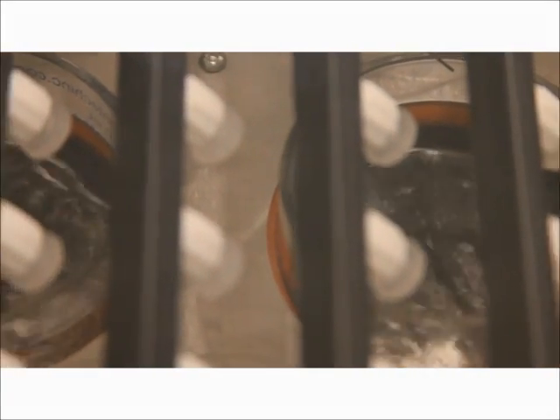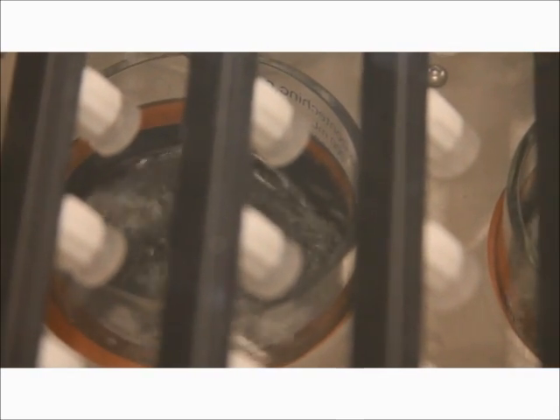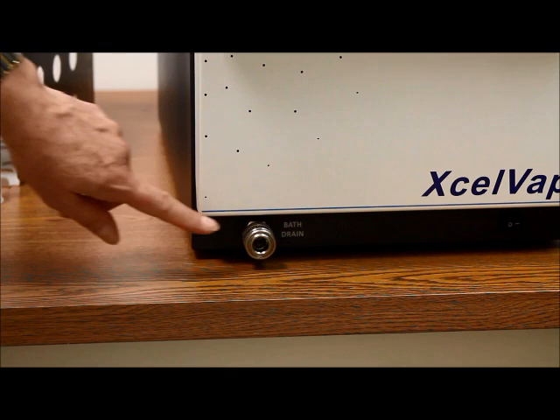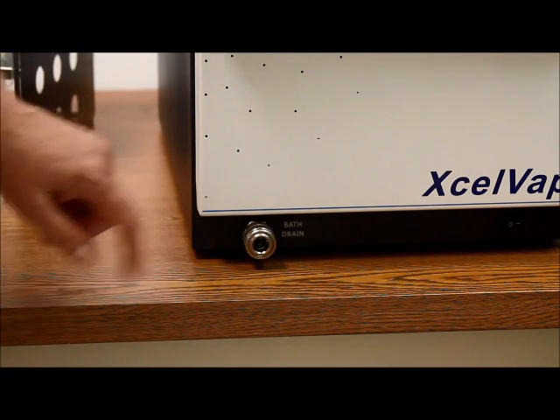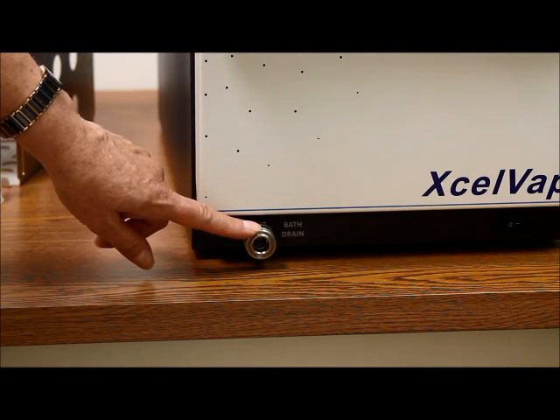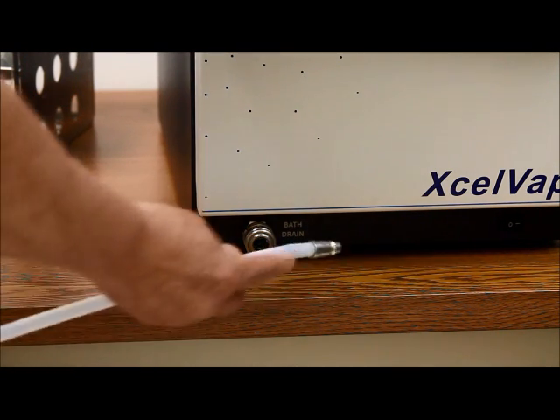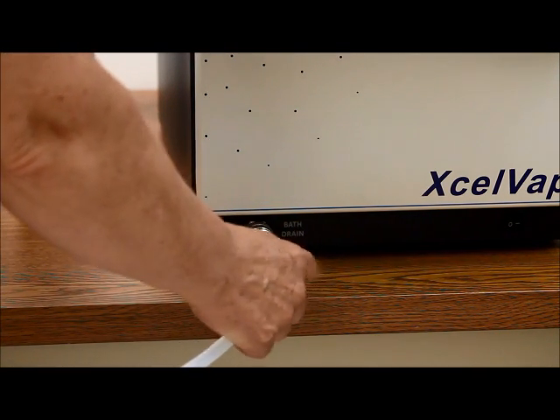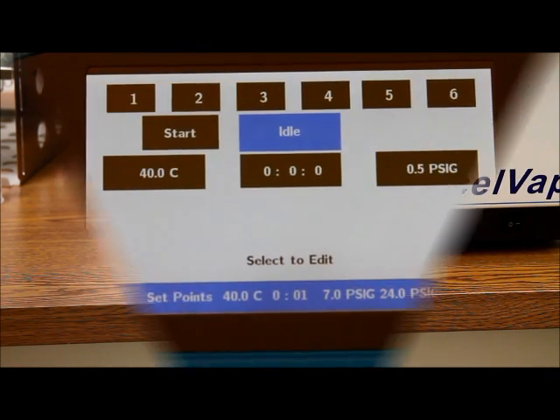Here we see the vortexing gas evaporating the solvent in the 200 milliliter vessel. You can see that the drain for the bath is located right on the front of the instrument. This makes it easy to access for draining the bath and keeping it clean by replacing the water on a regular basis. It's easy to pop the drain kit mechanism right into the drain.